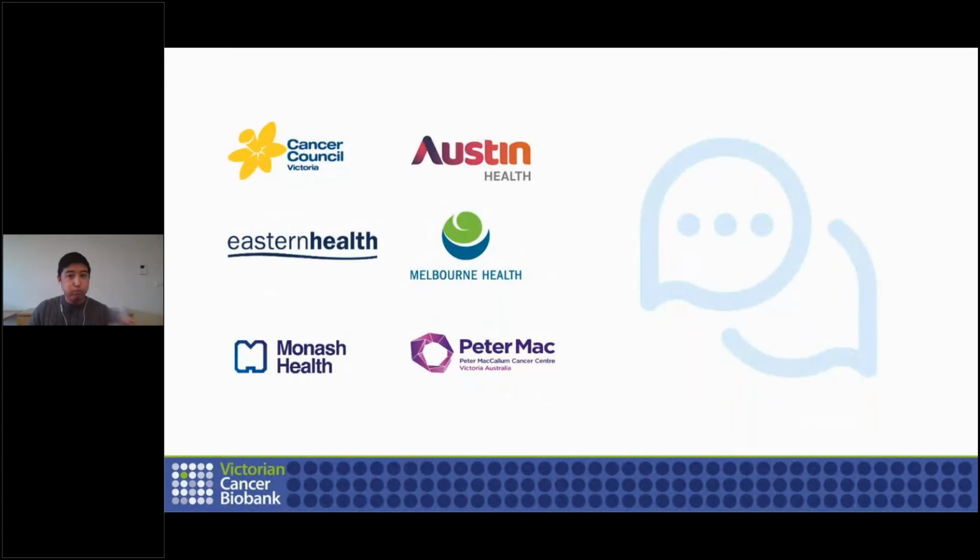So while people start thinking about their question, Duncan, I had a couple of questions noted from your talk. You talked about the reports that you generate, and there were quite a few of them, and they looked interesting too. Do you generate these reports manually, or do you use the schedule report feature to get it on a monthly, quarterly basis, or on an automatic basis?